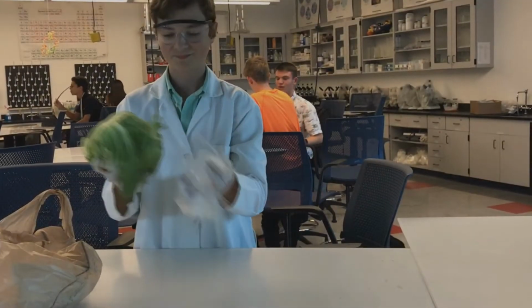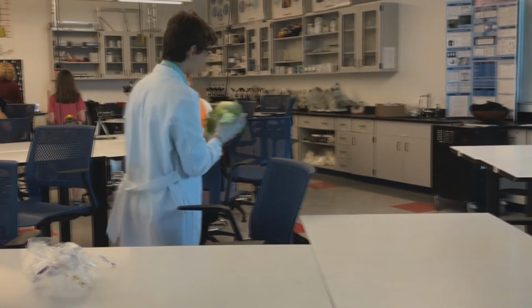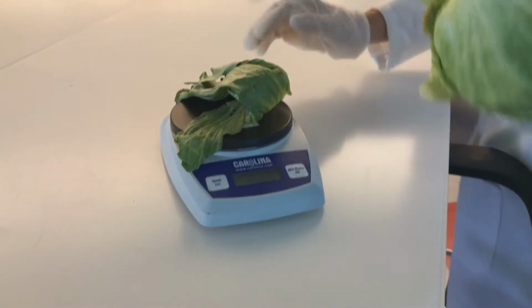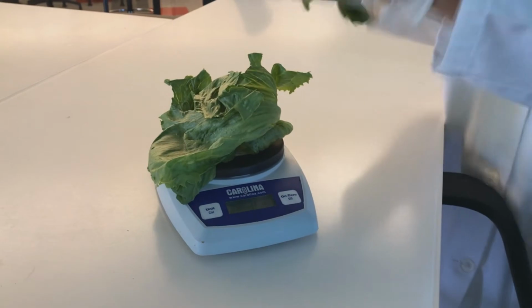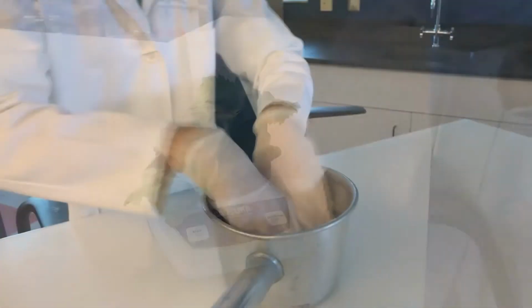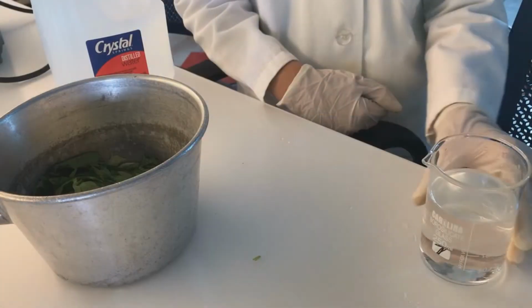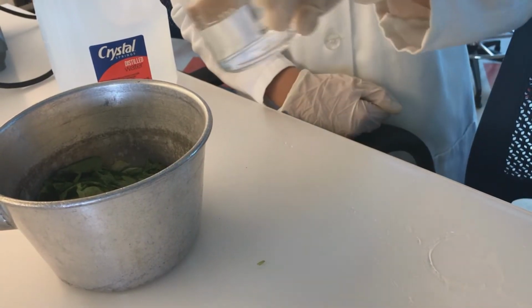First, we equipped latex gloves, safety goggles, and lab coats in case of accidents. Using the digital scale, 100 grams of cleaned iceberg lettuce were measured out. The lettuce was then placed in the pot and torn up in order for it to be fully submerged in 500 milliliters of distilled water.